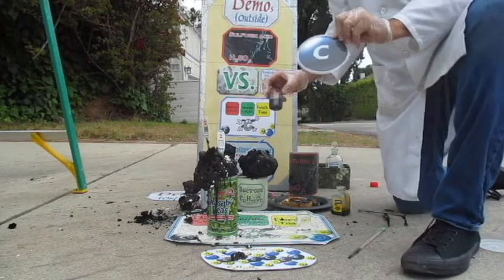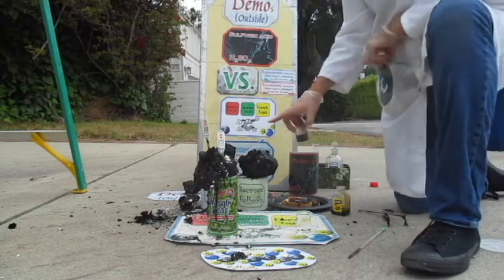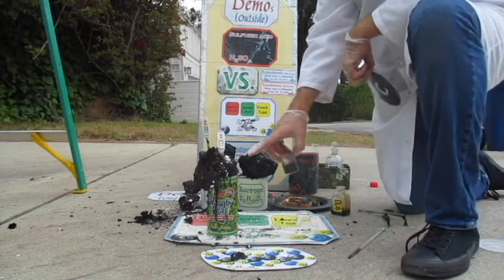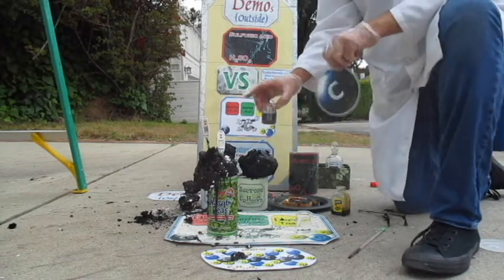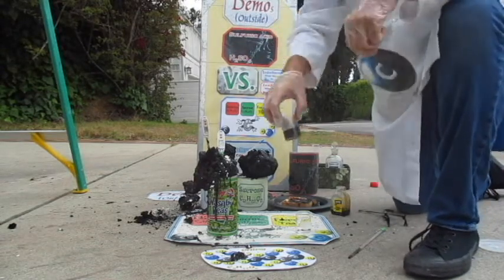Okay, so now you can see that there really is carbon in carbohydrates. Even though they have a very, very kind of white or brown appearance, if you take out the water, this is what is left, the carbon.